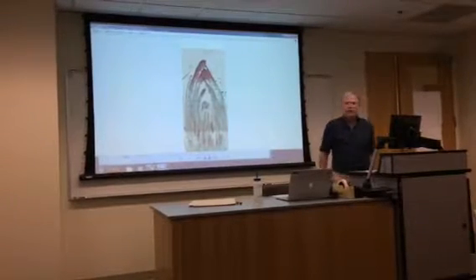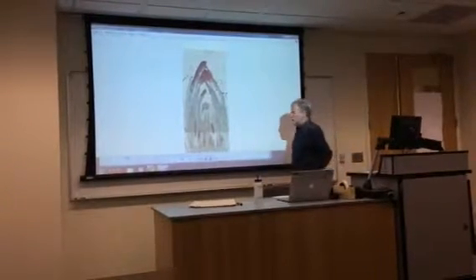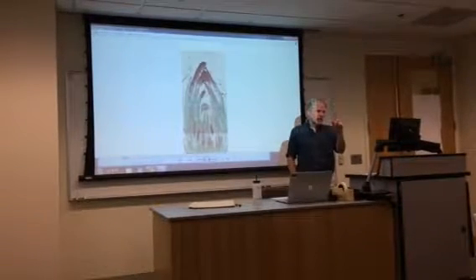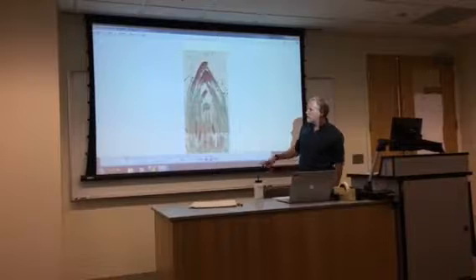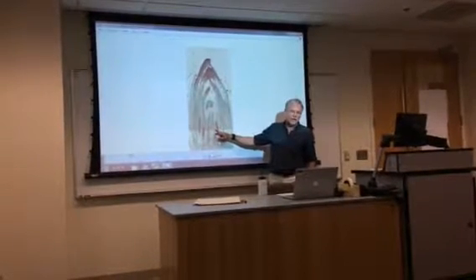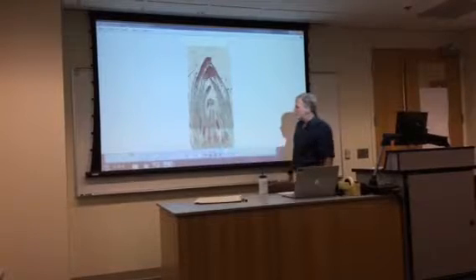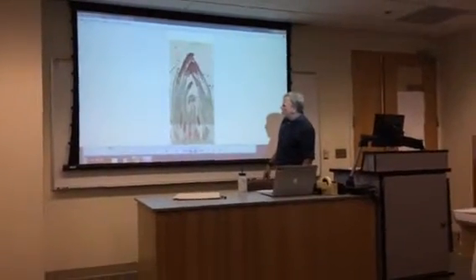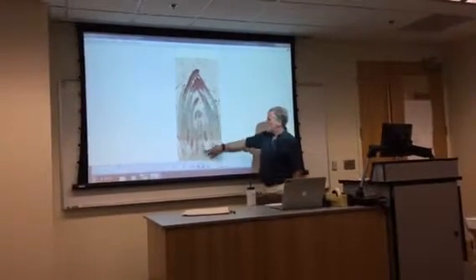Okay, this one's good. It turns out in some of these mosses, in Mnium anyhow, you have two separate plants. So they have these upright little plants sticking up. And at the top, they're going to make their gametangia. In this case, these are antheridia, because you see a bunch of sperm cells in there. They're not round, but they're kind of globose. And then they're at the top. And then there's all these extra leaves in here.